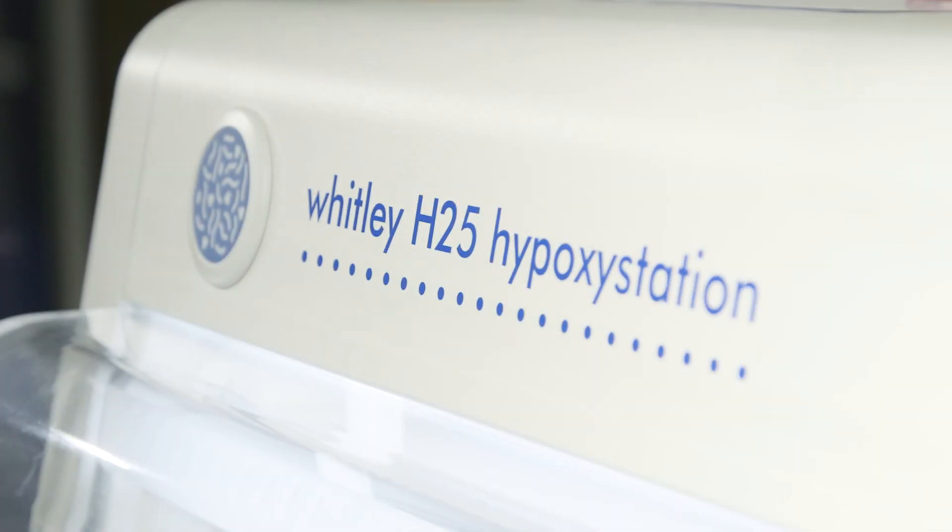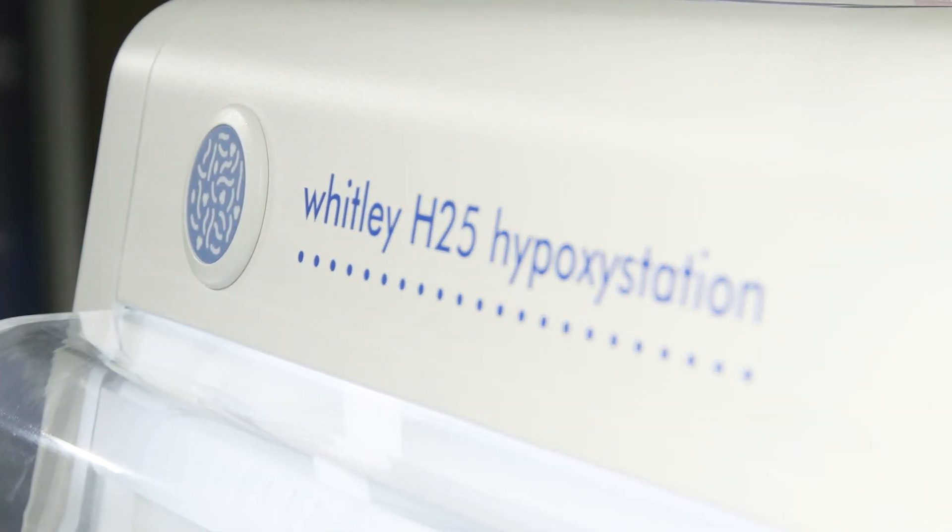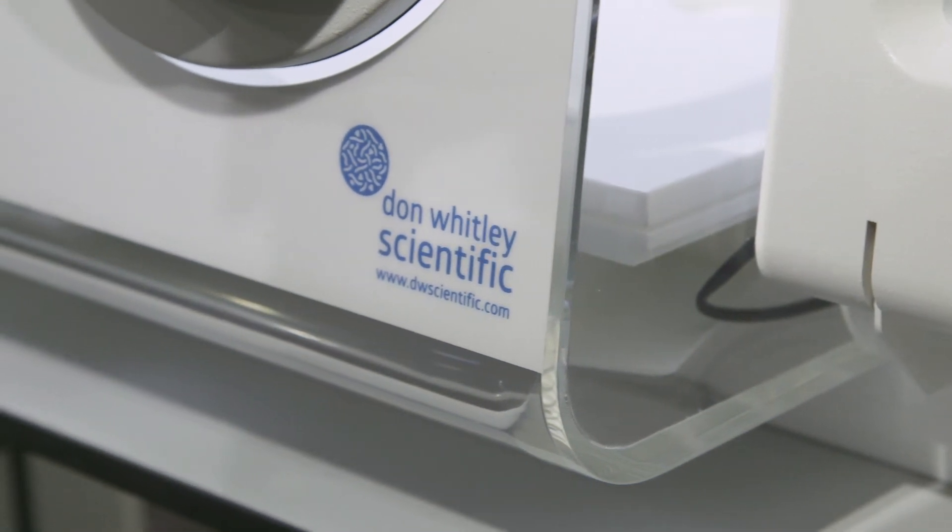With a wide selection of options available, the H25 can be tailored to your own specific requirements.